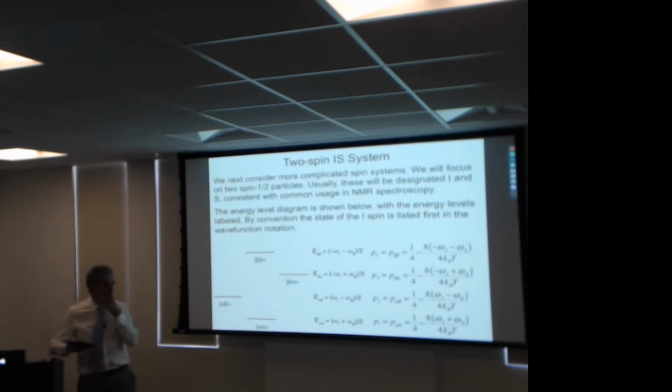All right, so what goes wrong? The first NMR spectra, the signals were basically blobs. The homogeneity of magnets improved. People learned how to build shims, or how to shim magnets. And the chemical shift was discovered. Then magnets continued to improve, and suddenly the resonance line split again into multiplets. And then it was figured out that those multiplets were caused by what we now call the scalar coupling.